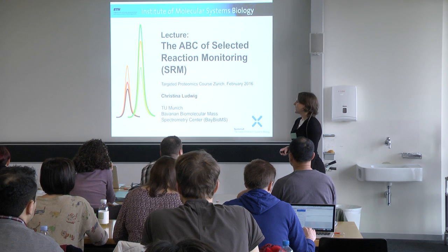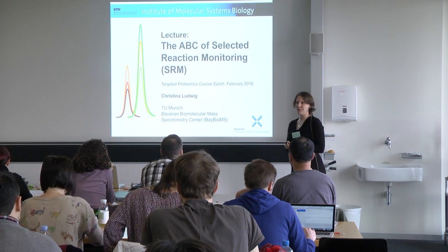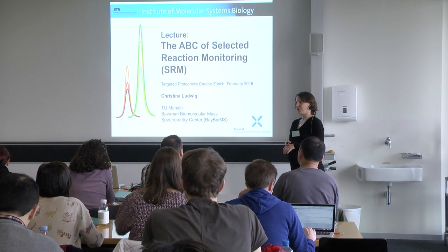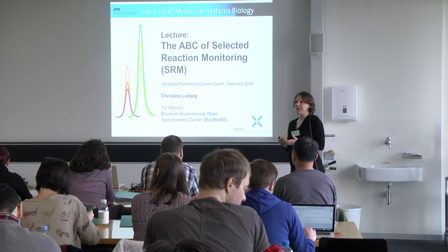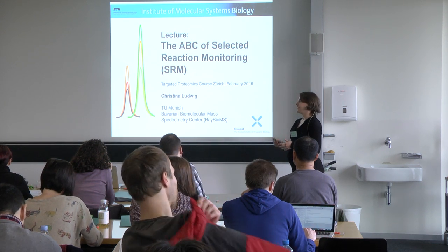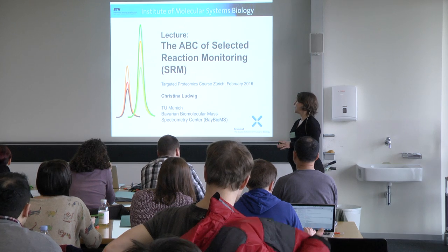The aim of this very first introductory lecture of the course is to discuss with you the most important basic principles of targeted proteomics in general and of selected reaction monitoring in particular.